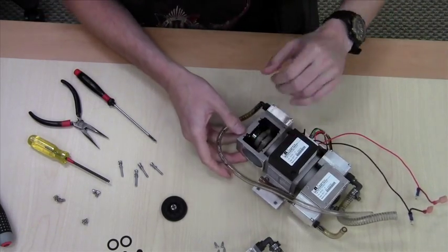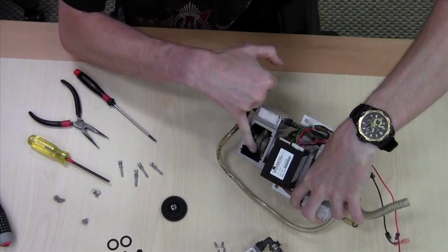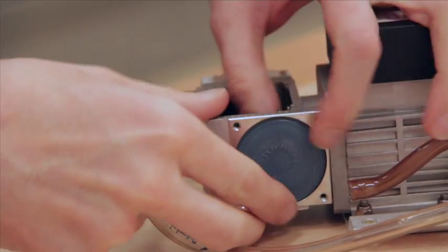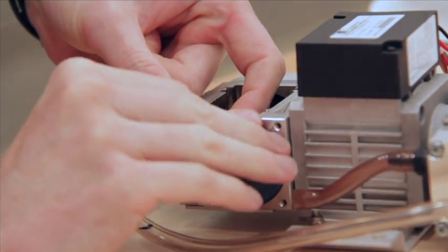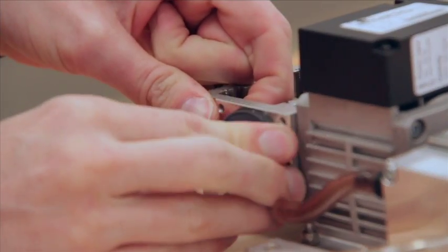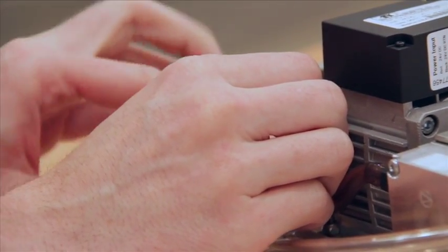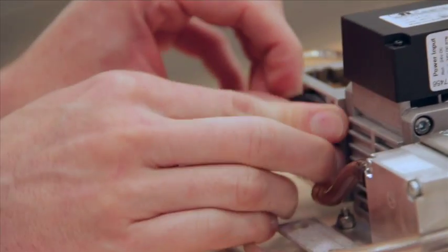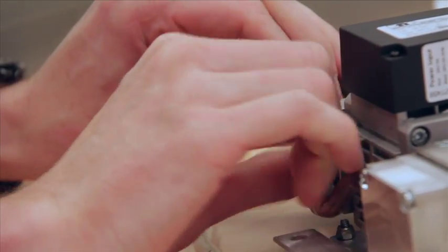Now to replace the diaphragm. This is the diaphragm here. You want to push from the inside out. When the diaphragm simply unscrews, it may take a little bit of force to do so. Grab the edge of the diaphragm and twist.